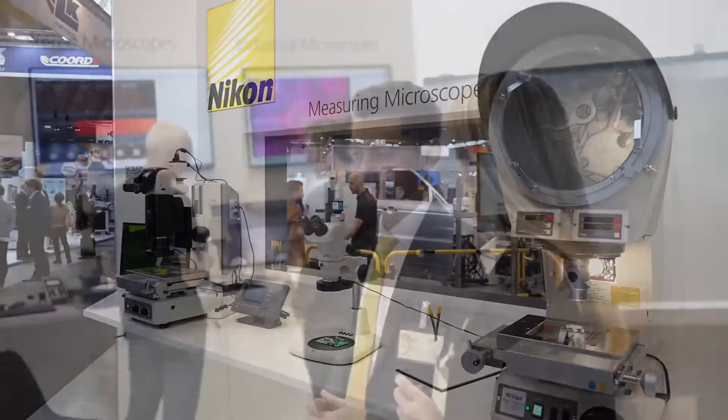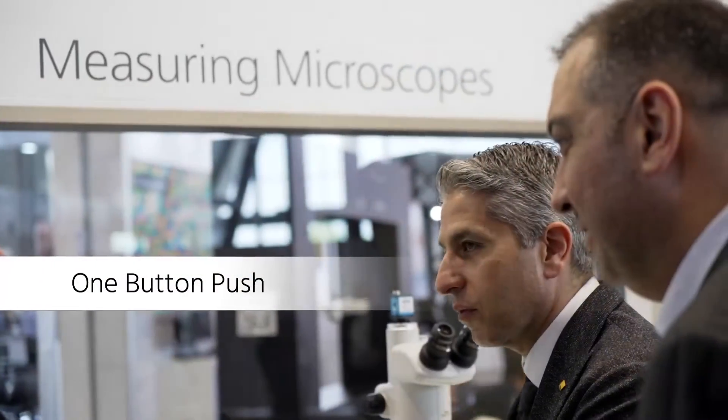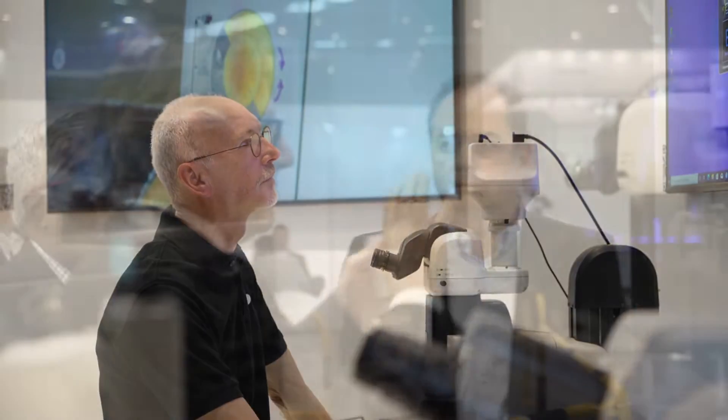A key innovation for Nikon Metrology this year is one-button press microscopy, where we take any particular sample, put it onto the stage, and do the inspection in one button press. This is key for a number of reasons — it's faster, it's more efficient, it allows you to do all your measurements in one go and do a lot of different jobs around a particular stage.